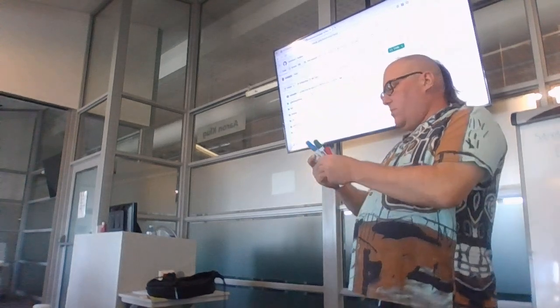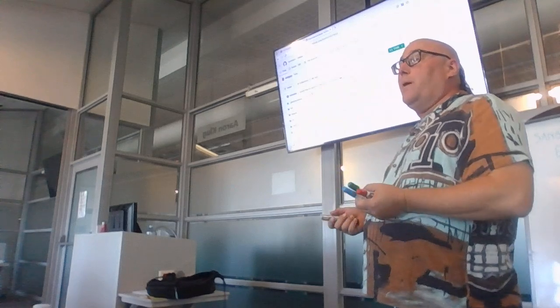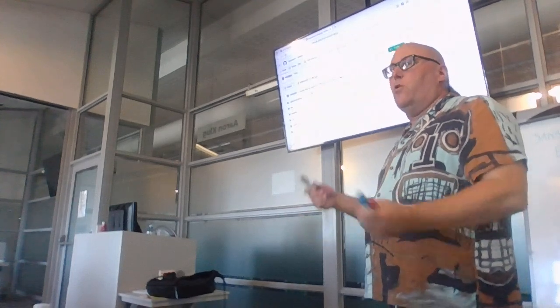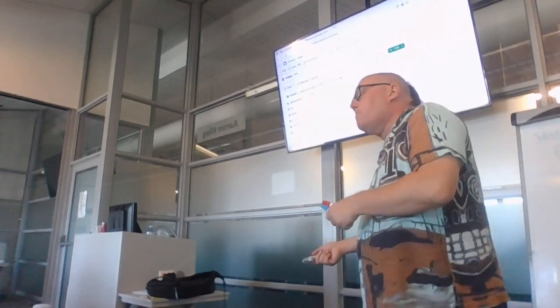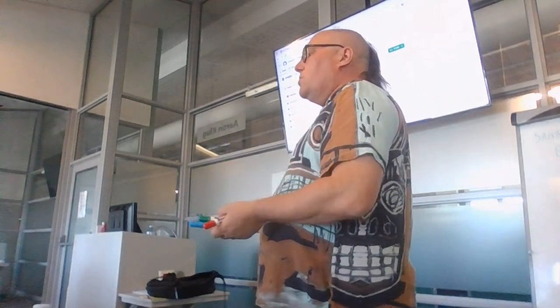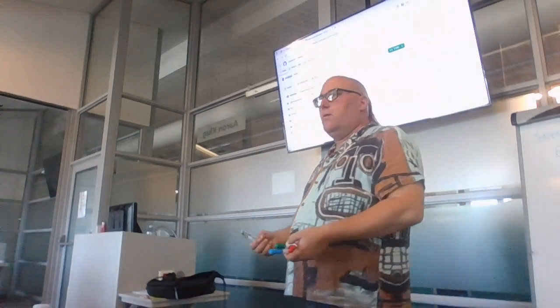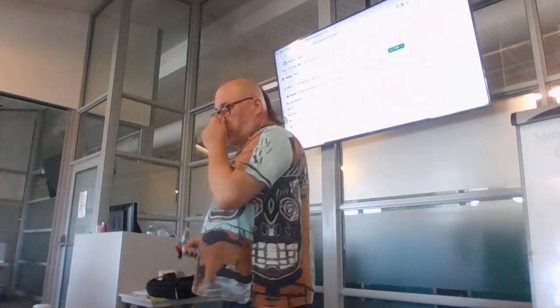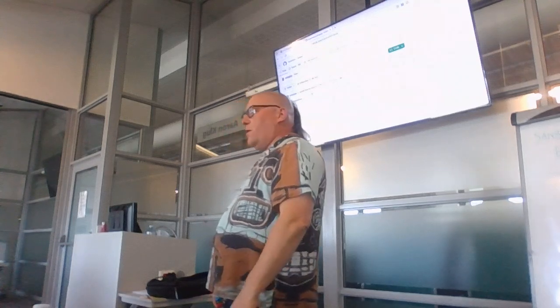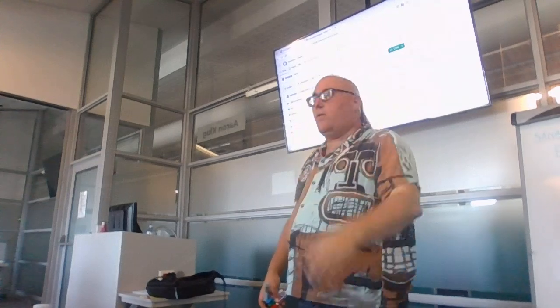And for mapping, oh, there's a big fancy pen today, okay. For mapping, obviously we know that before we do mapping, we do quality control. We did that by cleaning your reads using FastP. And then the next step is typically read mapping, for which there are tools like BBMap, Bowtie, and BWA, okay? BWA from Heng Li. And BWA has also never been published in a journal anywhere. Okay, it's one of the most widely used pieces of bioinformatics software, and it has never been published.